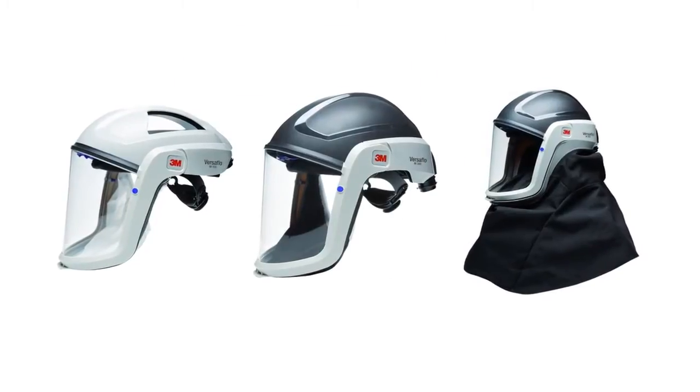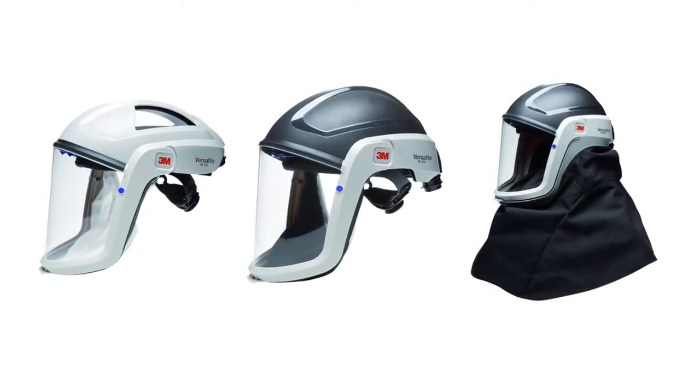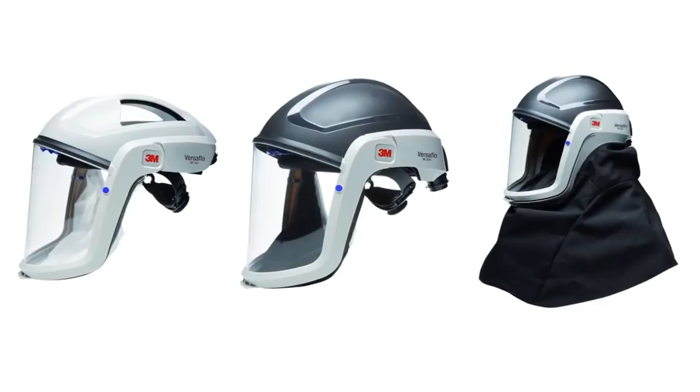Welcome to the 3M product training video for the 3M Versaflow M-Series Head Tops. This video will explain how to adjust and don your head tops as well as how to maintain them.